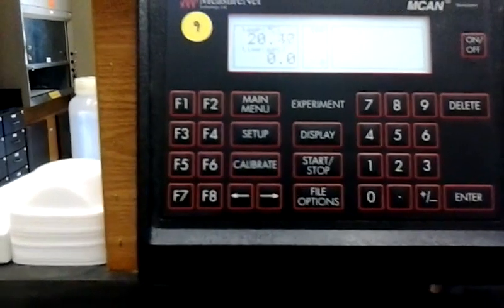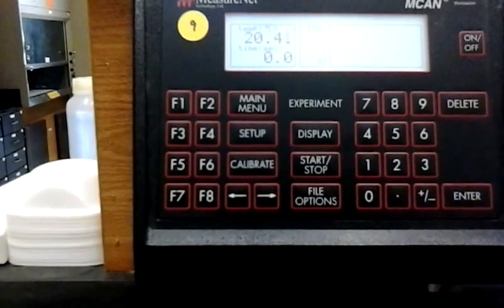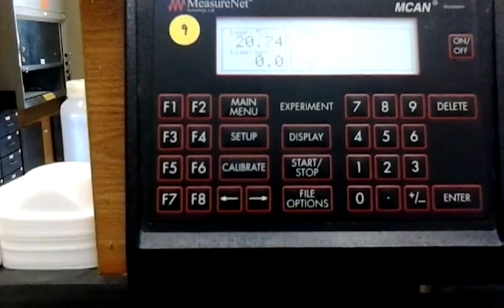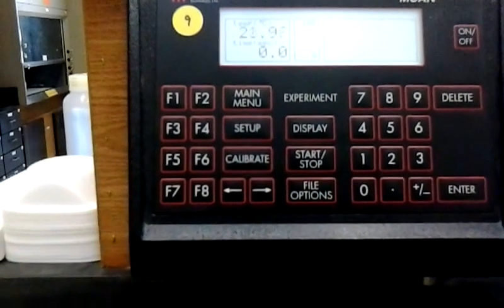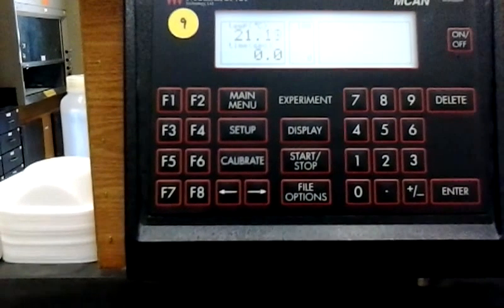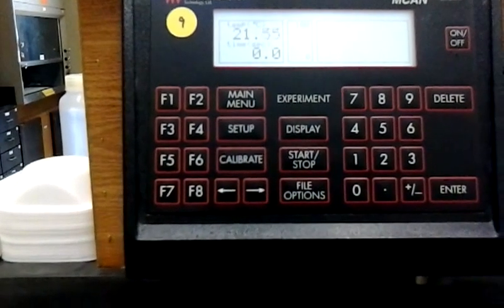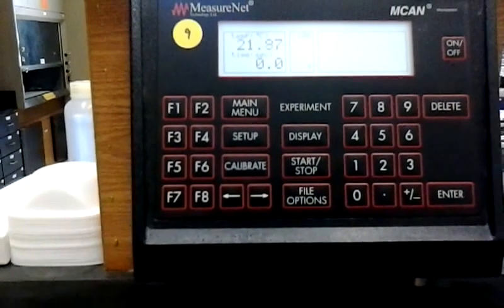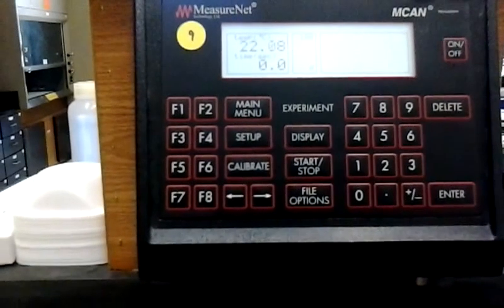So if I sit here and warm up the temperature probe, you see that the temperature is increasing as it's being heated. This tells you that the temperature probe is working correctly.